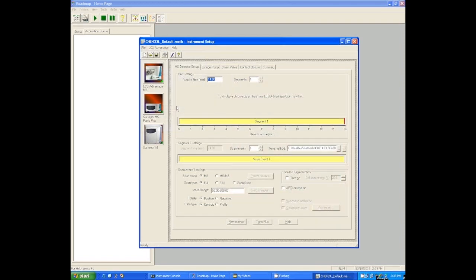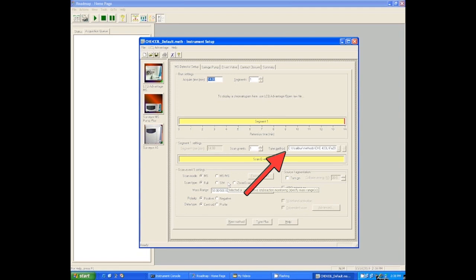The first thing you want to set up in this method is the tune method, and that's already going to be done for you. Just make sure you have the LCMS tune method selected.